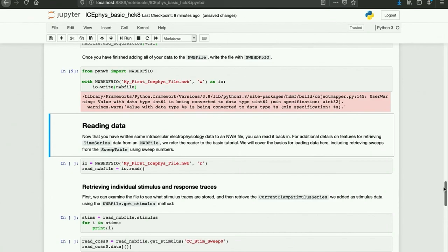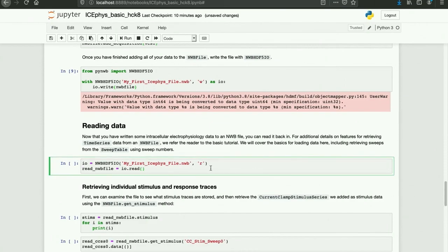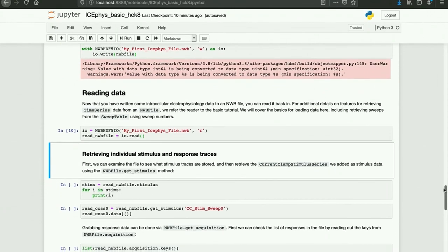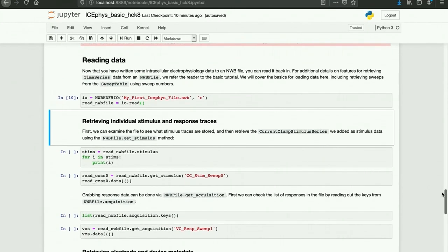We've created an NWBFile and now we can read it back in to show how to retrieve intracellular recording data in PyNWB. For additional features you can use to load data from NWBFiles, you should also have a look at the basic tutorials for extracellular electrophysiology and optical physiology. So first I'm going to read the file in. Now we can examine the file to see what stimulus traces are contained using NWBFile.stimulus. We can print out the names of the stimuli that were stored and then load the data from our selected stimulus trace using the NWBFile.getStimulus method.